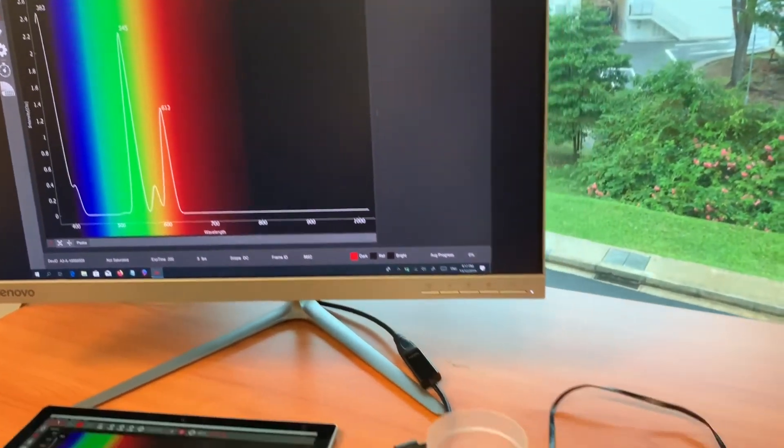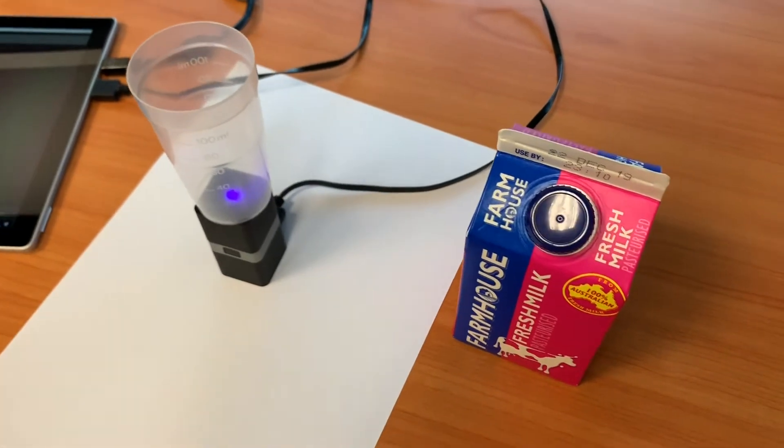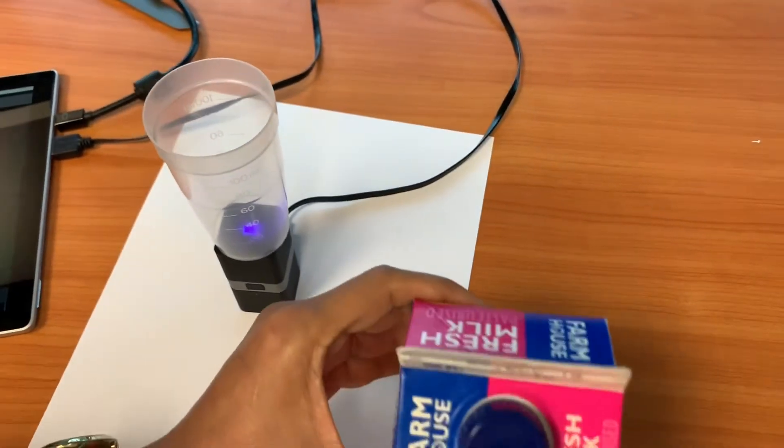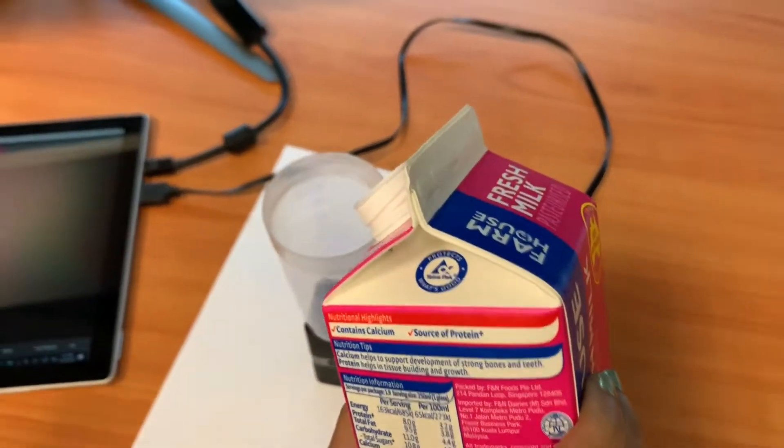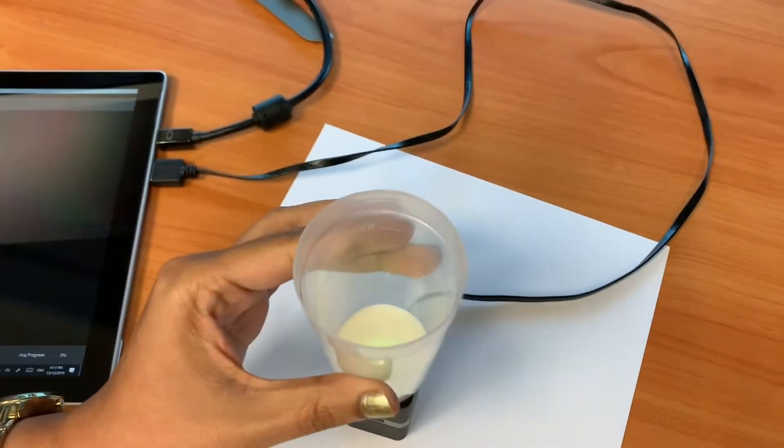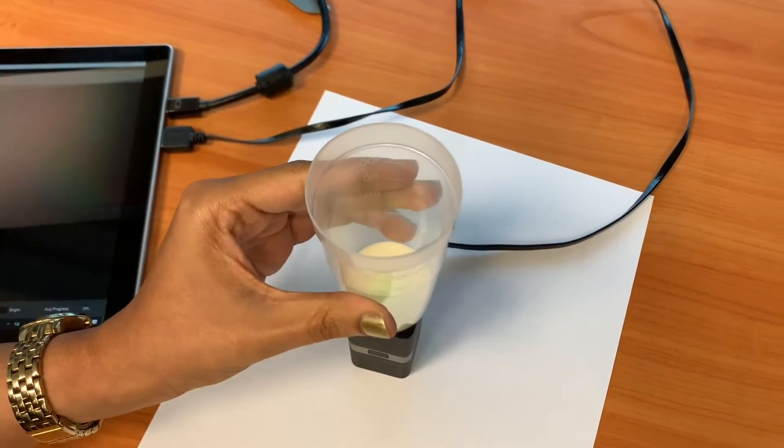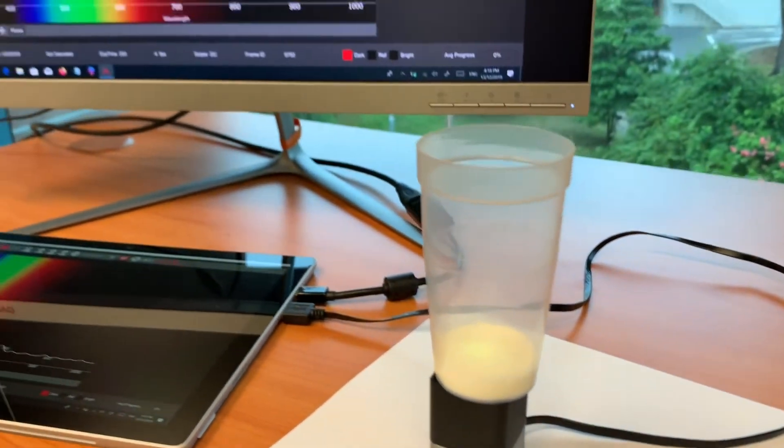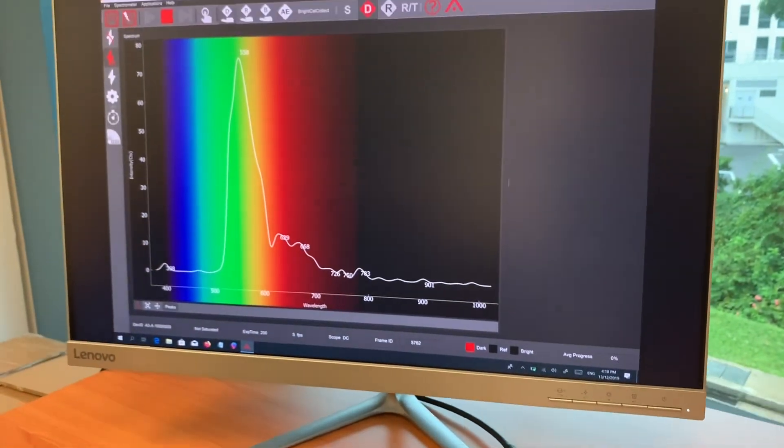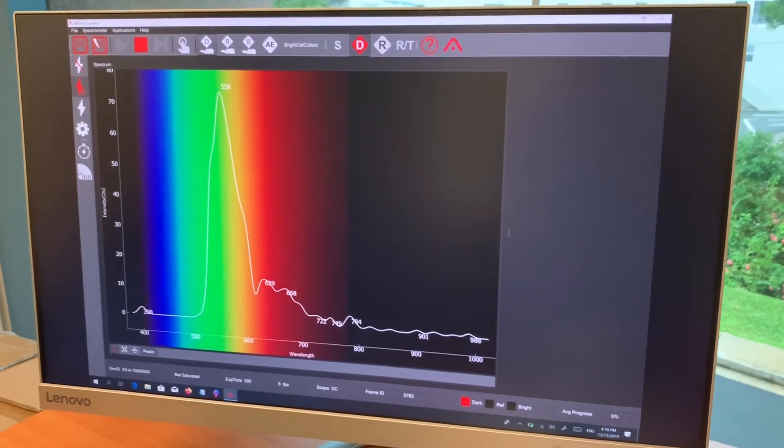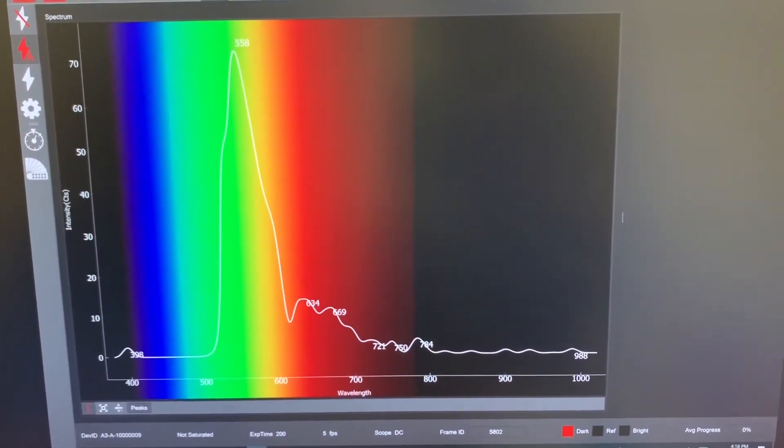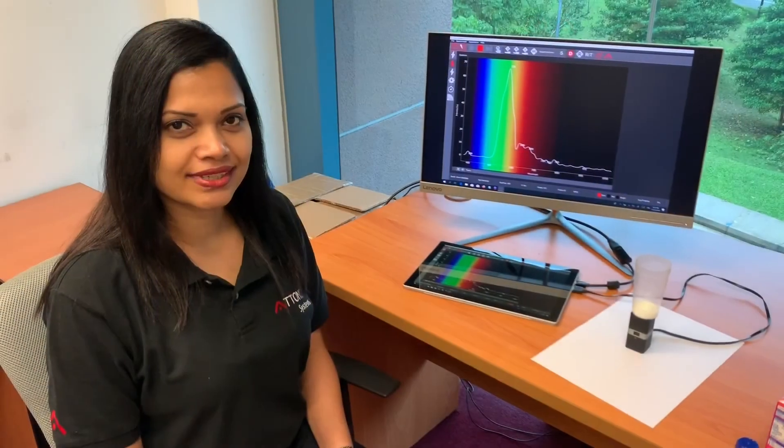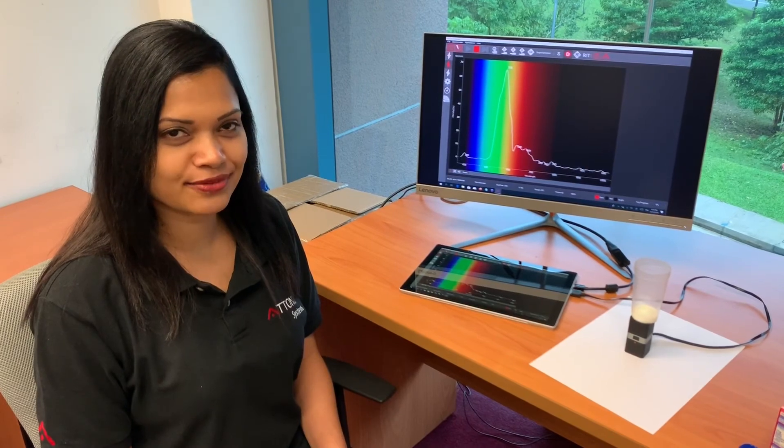Once this is done, milk is poured into the holder and the spectrum is acquired. This is the typical spectrum of milk when measured using our fluorescent spectrometer excited at 395 nanometers. This is the way to measure liquid samples. Thanks for your attention.